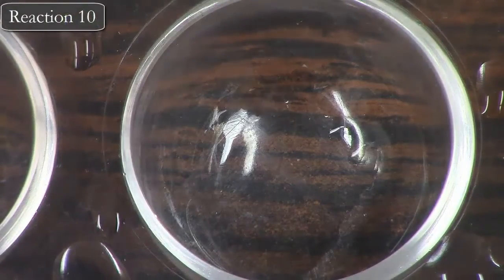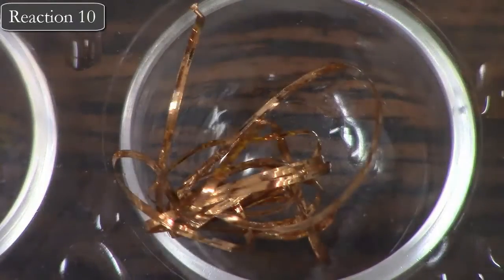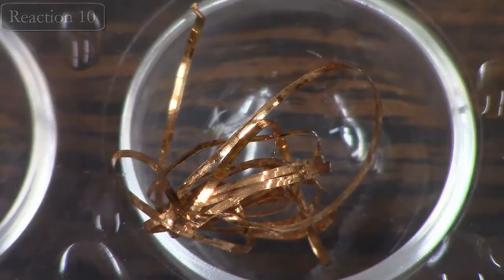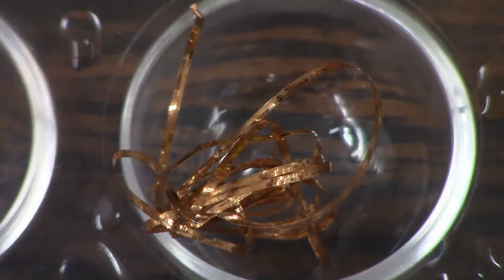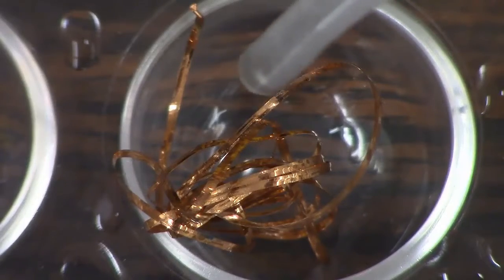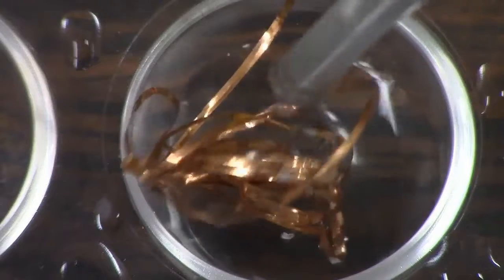Reaction number 10. So for this reaction, we're starting off with a small piece of solid copper wire. So this is copper. And then we're going to use a good old trusty pipette once again. And to that copper, we're going to be adding some silver nitrate solution. So this solution that's being dropped on the copper is silver nitrate.